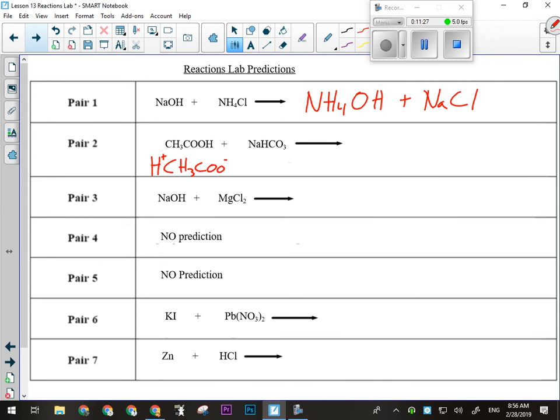It's not vinegar. Smells like vinegar, like way stronger than vinegar, like give you a bloody nose, knock you on your butt. Smells like vinegar, but be careful with it. It's super concentrated. That means don't squirt the little eyedroppers except into the reaction container. All right, so this is acetic acid.